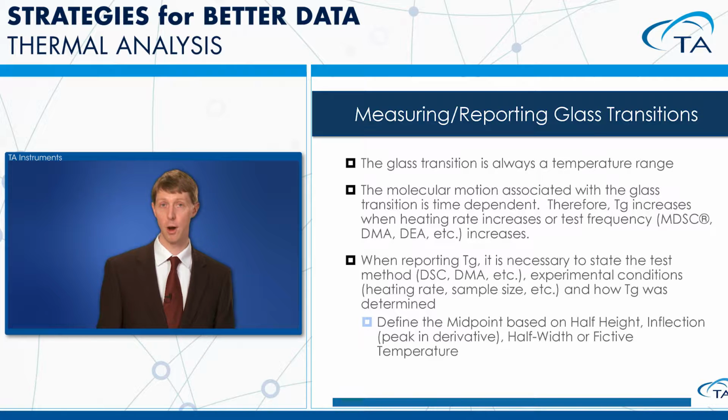You also want to be aware of that fact when you're trying to compare the glass transition that you measure to something that you may have found in literature. They may be using a different instrument. They may be using a different point on their particular curve. So you just need to be aware of that. As long as you're consistent, you can easily compare the glass transition temperature of your particular material set.